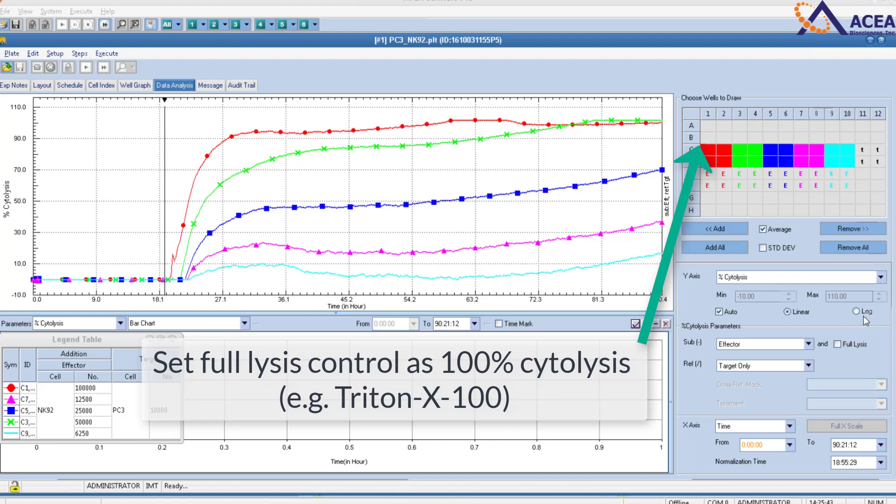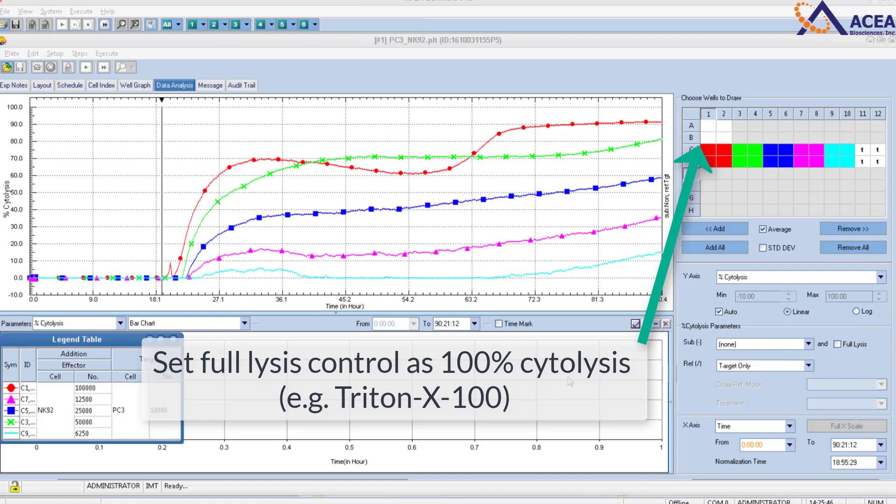Set a full lysis control as 100% lysis. For example, use Triton X 100 in those wells.